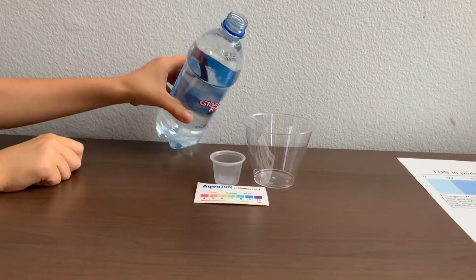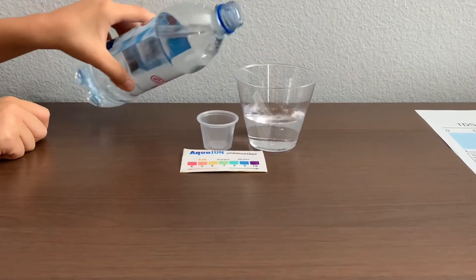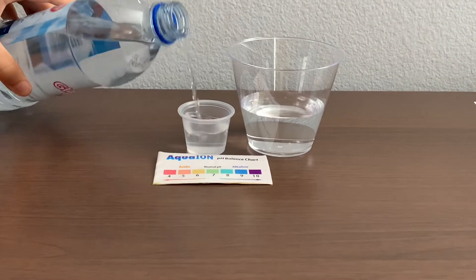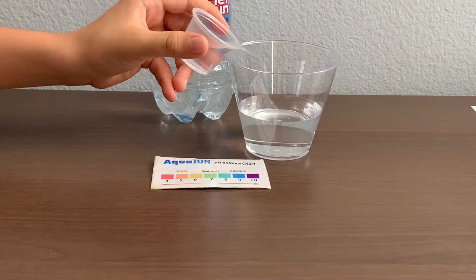Let's pour some water in. This is a little too much for the pH cup. Let's pour some back into the TDS.